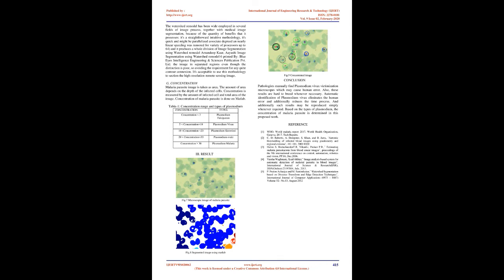A pixel is considered a perimeter pixel if it satisfies both of these criteria: the pixel is on, and one or more of the pixels in its neighborhood is off. In digital image processing, the morphological skeleton is a skeleton, or medial axis, representation of a shape or binary image, computed by means of morphological operations.